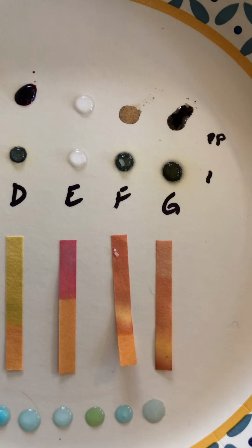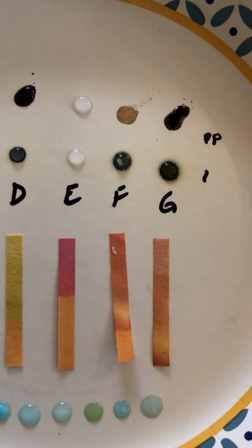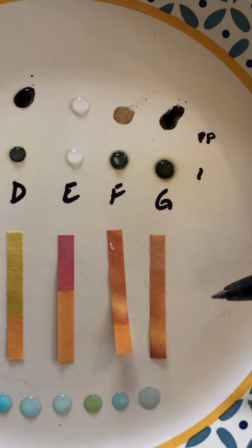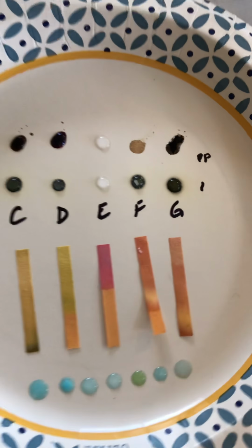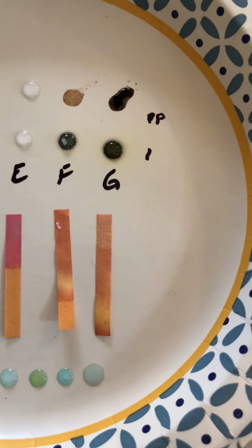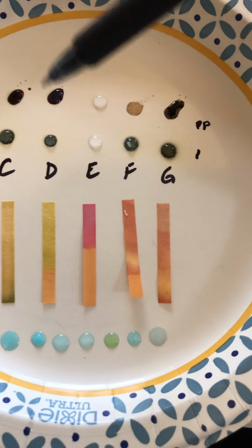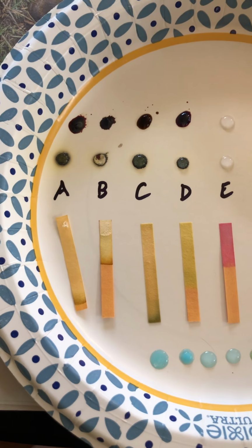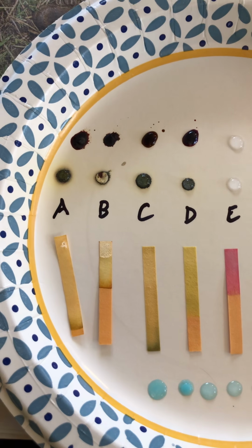So with the potassium permanganate, I know that indicates the presence of alcohols or aldehydes. When you look at the difference between the structure of benzoic acid and salicylic acid, which were the 2 options, salicylic acid has more alcohols, so I would expect a stronger reaction. So G became our salicylic acid, and F became our benzoic acid. Okay, so now we have the 3 acids taken care of, and now we move on to the more basic compounds. So let me look at my notes.